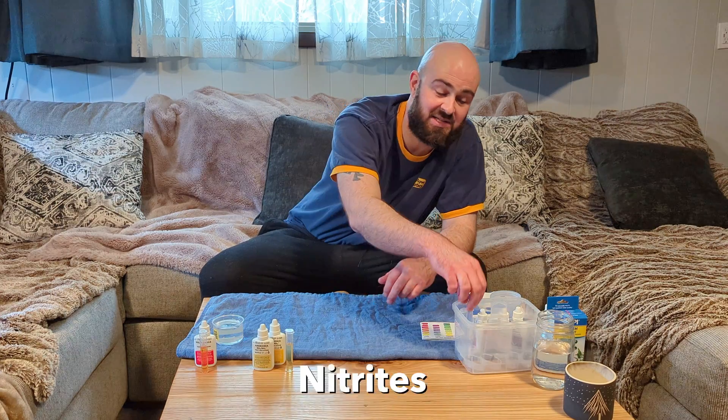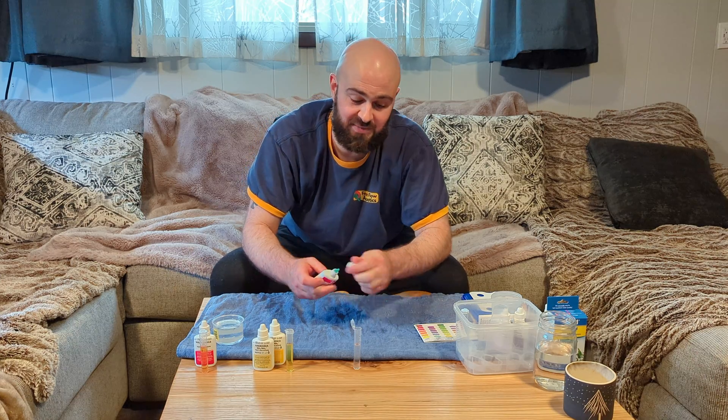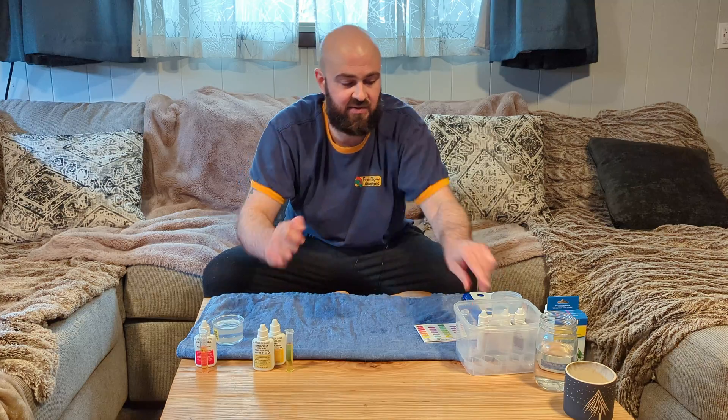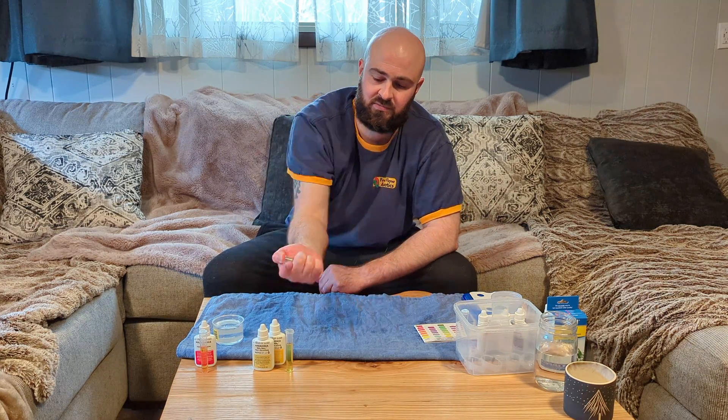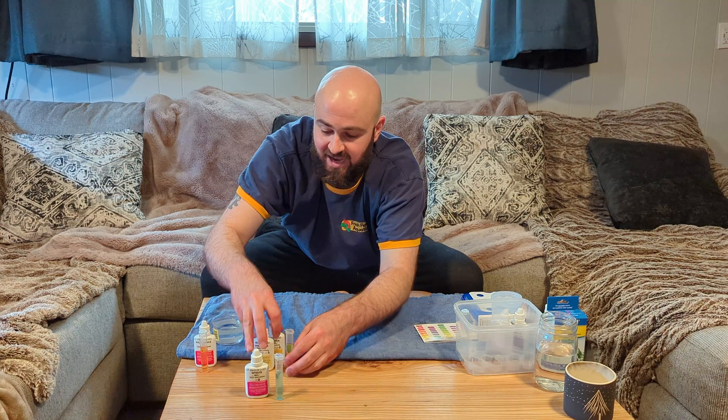While we're waiting five minutes, I'm going to go ahead and test the nitrites. For the nitrites, all you're going to do is add five drops, give it a good inversion, and then let that sit for five minutes as well.